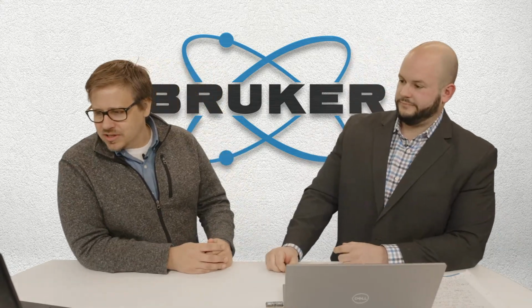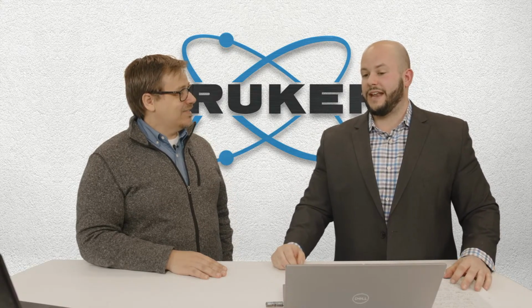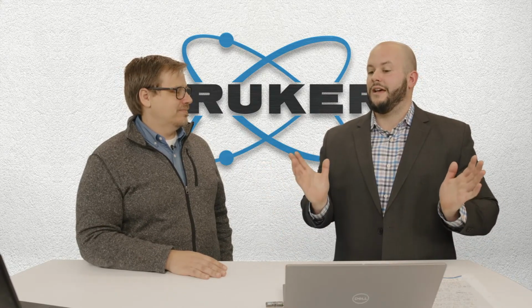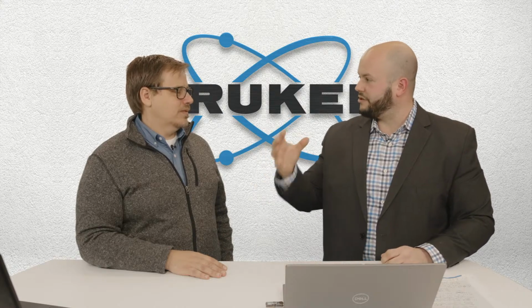Here we go, we got another question that came in. Cromarty asks, do you have any tips for aligning a measurement on a bowed wafer? A higher incident angle is probably what I would recommend. Yeah, that's a good one. For samples that I've had issues with like that, I had better luck picking a higher 2 theta angle, as long as I still get reflection from that, to align the specular reflection on the detector.